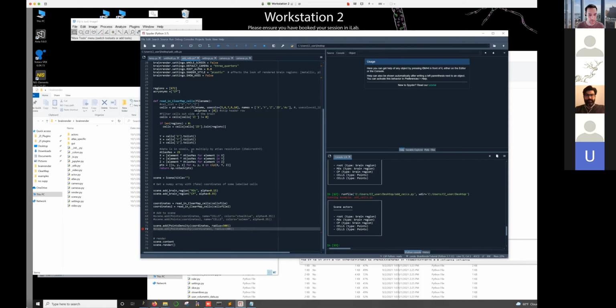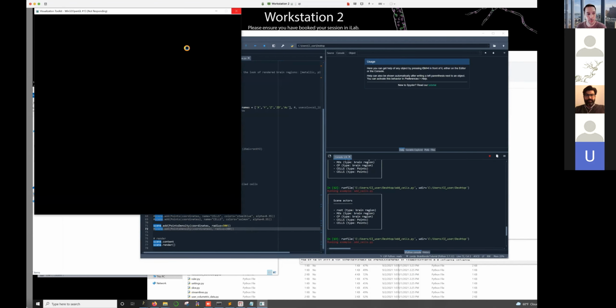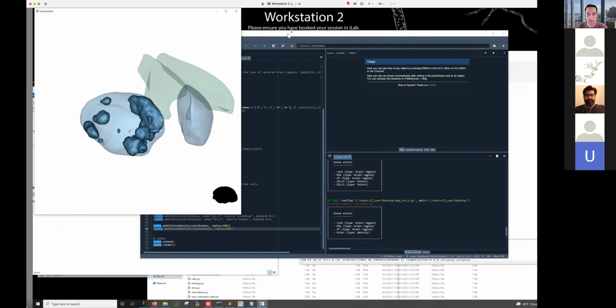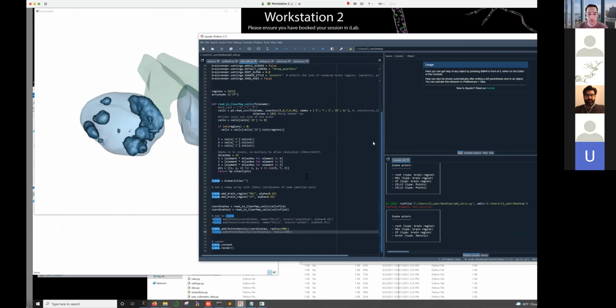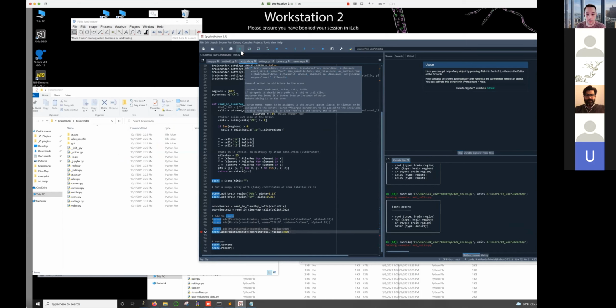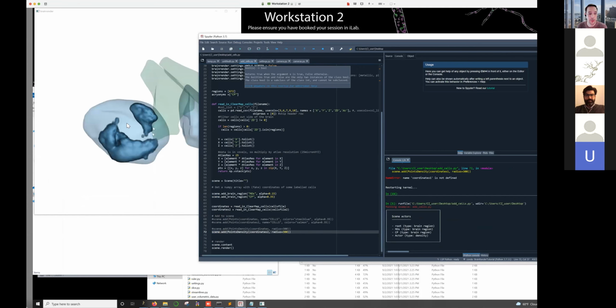This might take a little bit longer to render because it has to actually calculate these densities, but actually it's not too bad. So there's our, I guess that's our saline. Yeah, that's our saline. And if we add another and run this again, this will be our, okay, and you can see a little bit of a different density here.